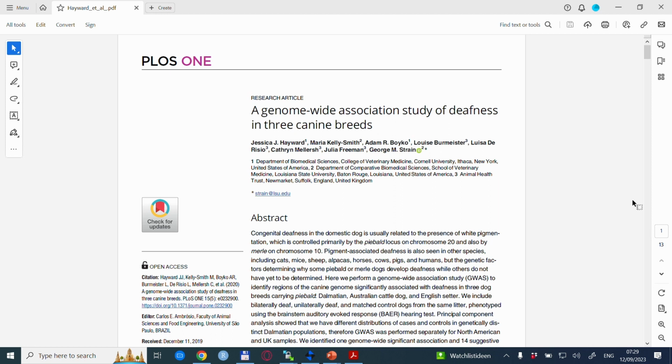In this video we will do a tutorial and a showcase of the long-awaited genome-wide association studies. And we will do it on the data of the paper that is described here, the genome-wide association study of deafness in 3 canine breeds.